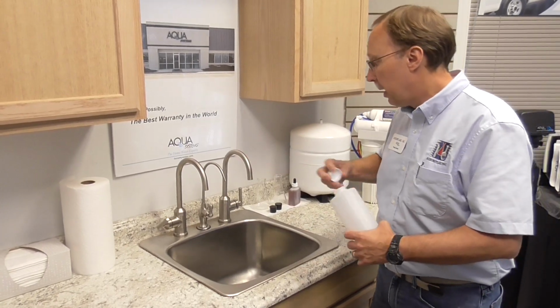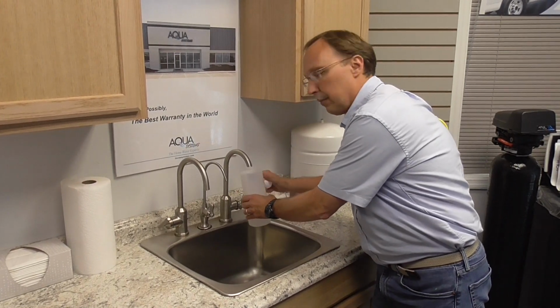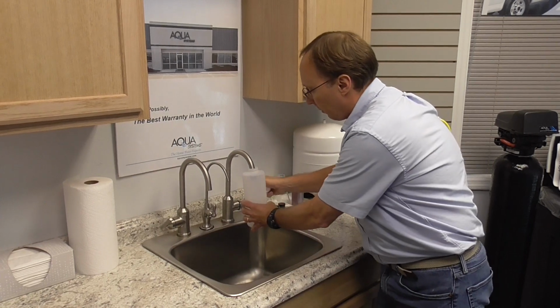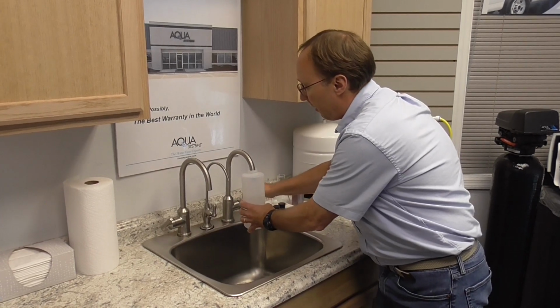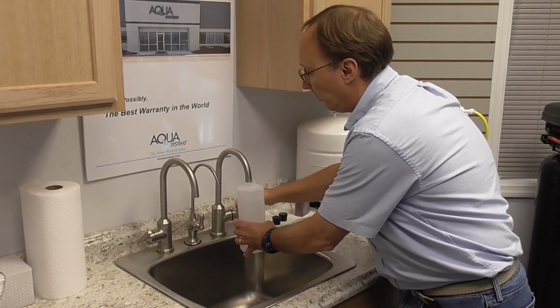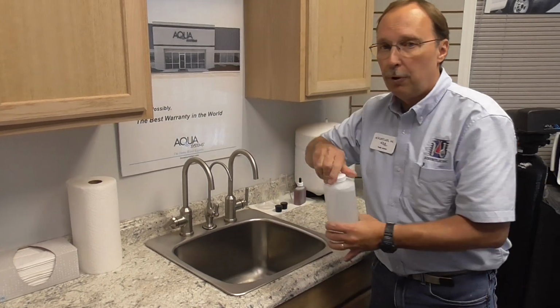You want to come to this spigot. You don't want to flush it first. You just want to turn it on. Fill this container up completely full for us. And we're almost there. Alright, and that is your sample for lead.